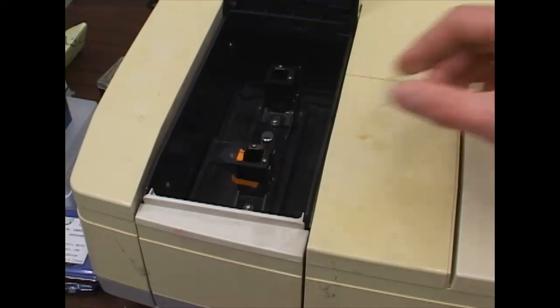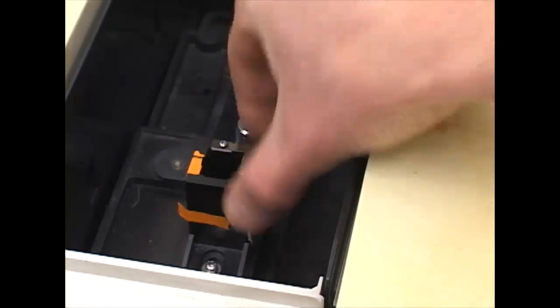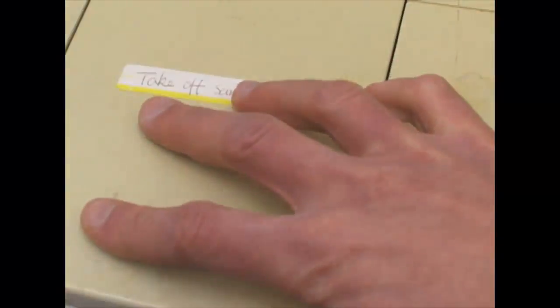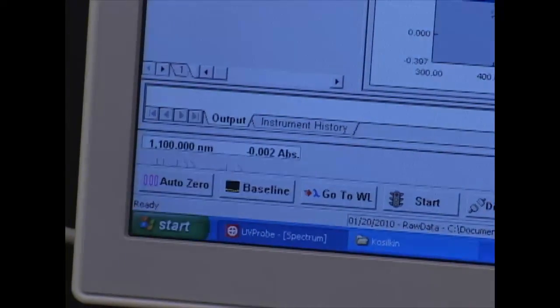For glass slides we have a little holder on the side. We are going to load our blank sample. We have to do baseline again because we changed the type of the sample.